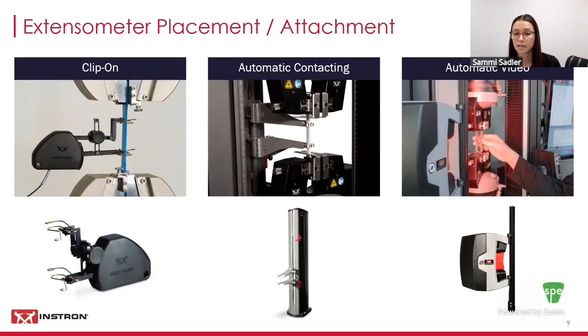So the type of extensometer that you use will have an effect on the repeatability of your data. As just talked about, it's mainly due to human error. So choosing an automatic extensometer will allow for a lot more consistent results.